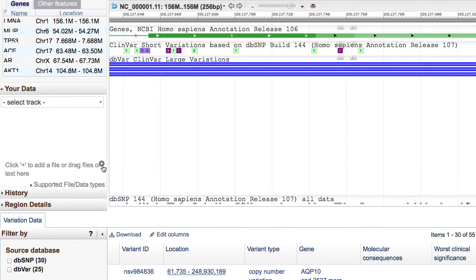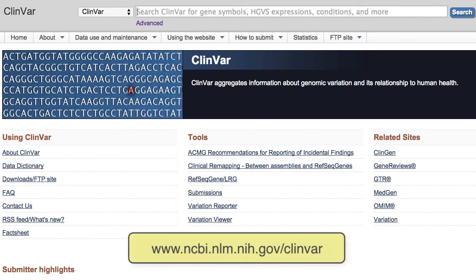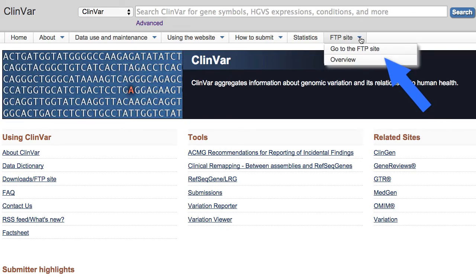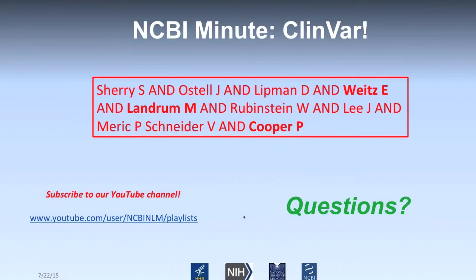You can also upload your own data into Variation Viewer, which is covered in the Variation Viewer webinar. Finally, for batch download from ClinVar, the easiest approach is to go to the FTP site. From the ClinVar site there is a link that says 'go to the FTP site,' where it's trivial to get a VCF of all ClinVar assertions, or those assertions in XML format, depending on what you prefer to parse.